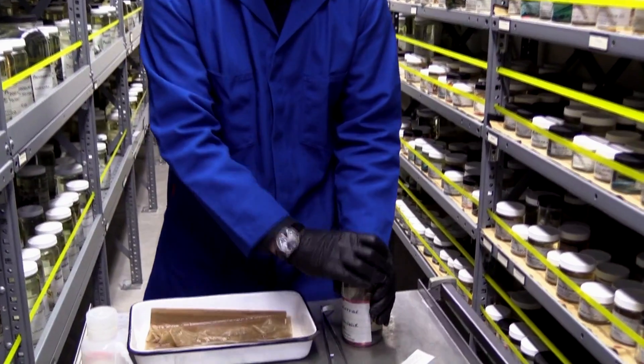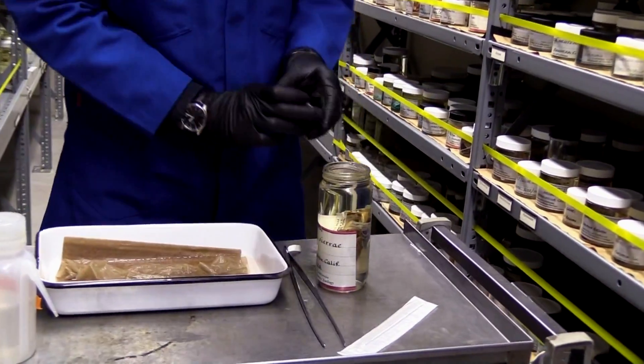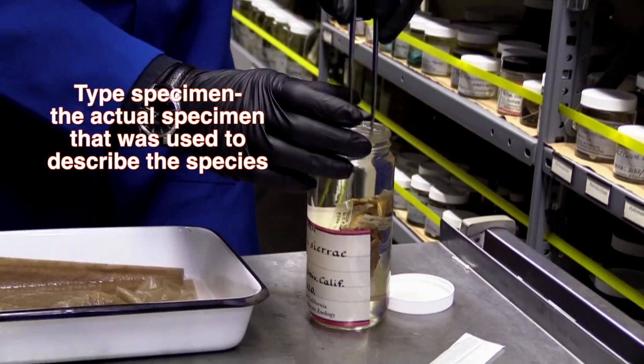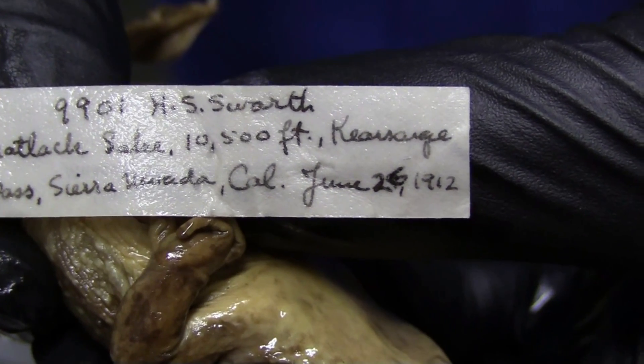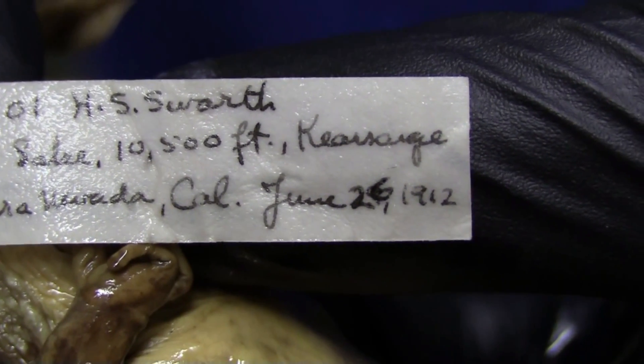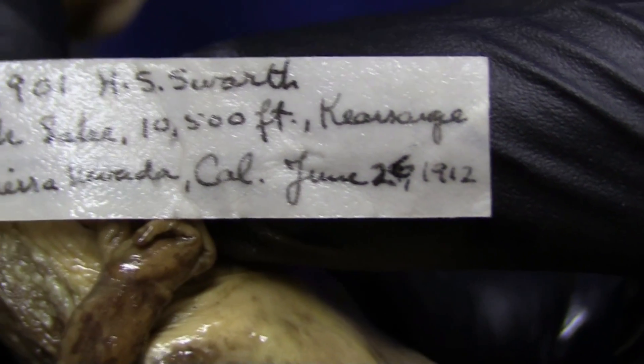I have to be very careful with this because this is actually the specimen that describes the species — it's called the type specimen. Here's the original tag from the frog: collected June 26, 1912, at Kearsarge Pass, California, at 10,500 feet.